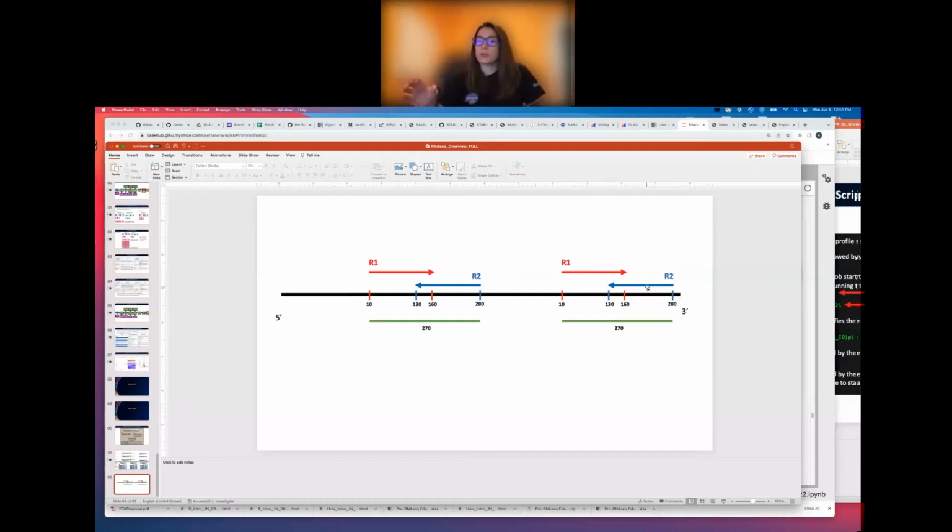And so if it has a really similar sequence somewhere else in the genome, then your tool, as long as it matches within the amount of errors you allow it. So what GeneLab does is we allow a 4 base pair mismatch for every 100 base pair read length. So as long as it maps within that criteria to anywhere on the transcriptome, in this case we're looking at a line transcriptome, then it'll show up in the BAM file. So now if we have something like this, what we'll get back in the BAM file is our mate pair here with this template length mapping to these genomic coordinates here and here.